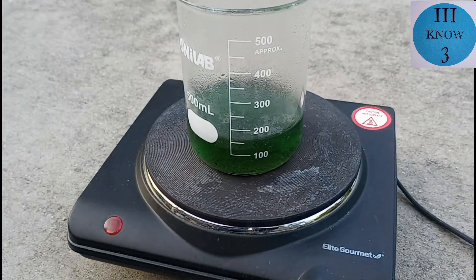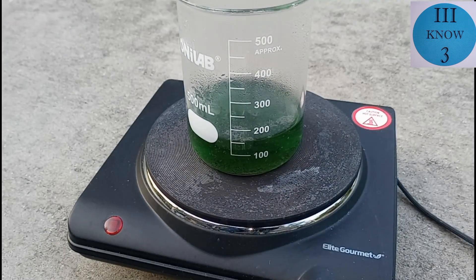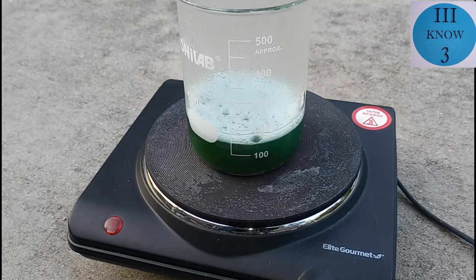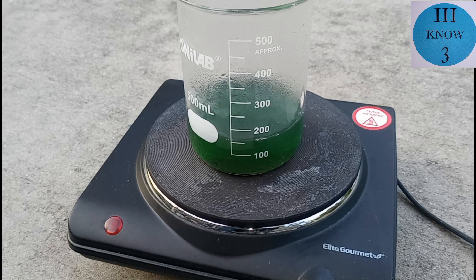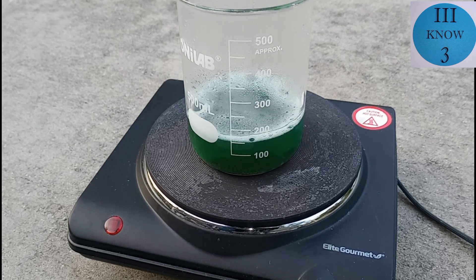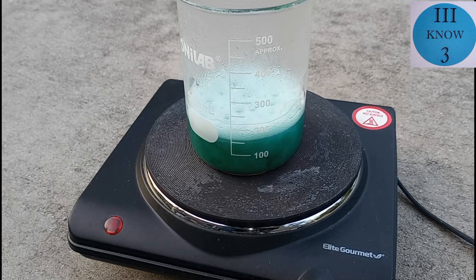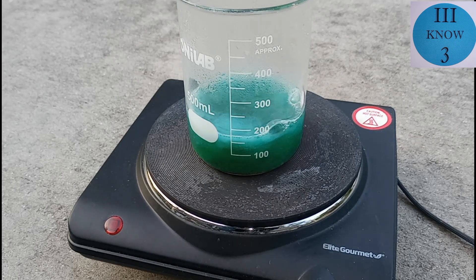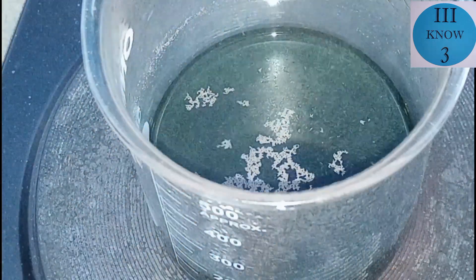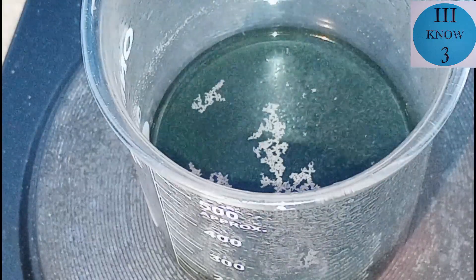We allowed it to boil down for a little while and it became a nice dark green color, probably from the copper chloride. Then we decided to add some more hydrogen peroxide to try to dissolve the rest of the material. We only added a little bit at a time to keep it from overflowing.